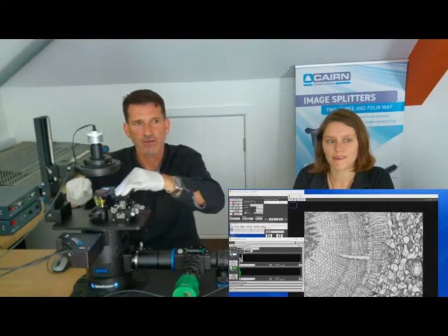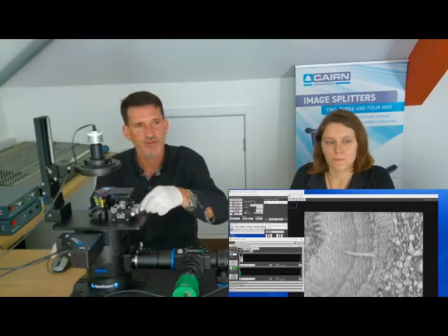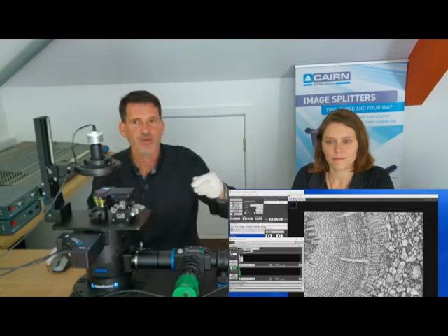There we go. That took a while. But then once you've got the sample in the field of view, then you've got X, Y, and Z adjustment. So hopefully this has been interesting for you.